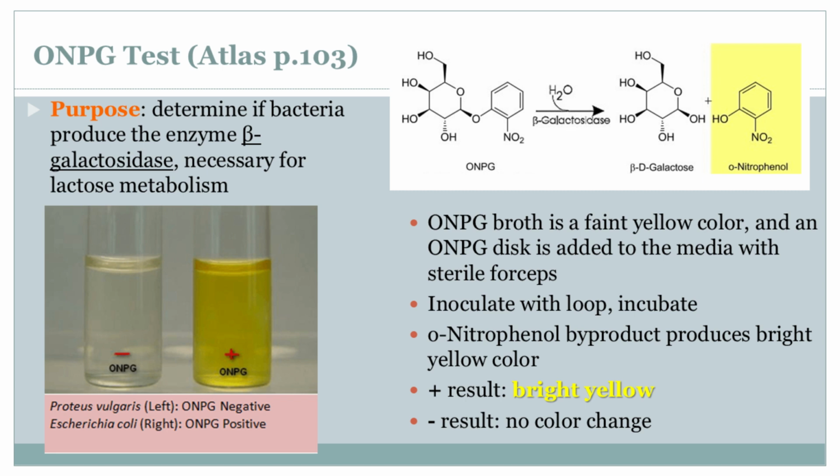You got it. It's all about what we see after that incubation time. If the broth is still clear, no galactosidase. But if it's that bright yellow... We know those bacteria are having a blast with that lactose imposter. Exactly. That color change is confirmation. It's how we know the bacteria actually have the enzyme. So simple, but so smart. I love how it's this mix of basic chemistry and really clever observation.